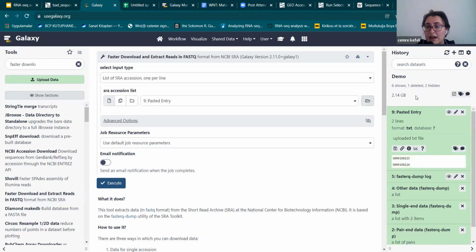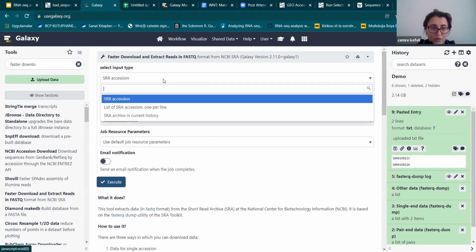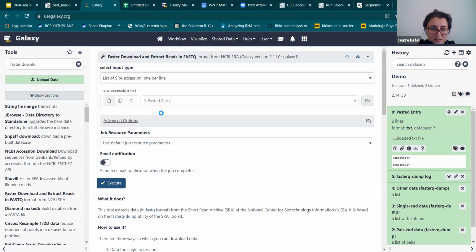Actually, I should explain every job that I'm jumping through, but in here, if we click the name, we can see the details about this element. It's a text file, or we can download it, or there are some details. If I click details, it shows the details over here. And if I want to see the content in a whole page, I click this eye icon and I see this, yeah, in here.